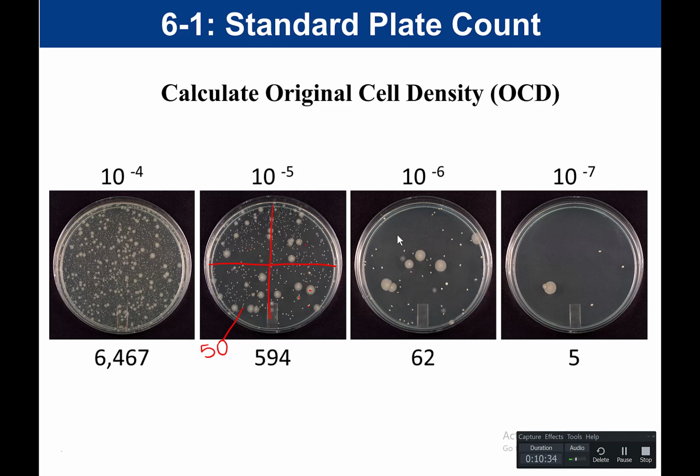You also want to have a general understanding, and this was something I talked about in the video, of why the colonies are different sizes. Why are some of the colonies so much larger than other colonies? That was because I told you that the bacteria growing aerobically, meaning on the top of the agar where oxygen is available, is going to grow faster than bacteria growing within the agar, because remember, you mix the bacteria with the agar and then pour it. Bacteria in the middle of the agar are not getting access to oxygen, and therefore they grow slower.